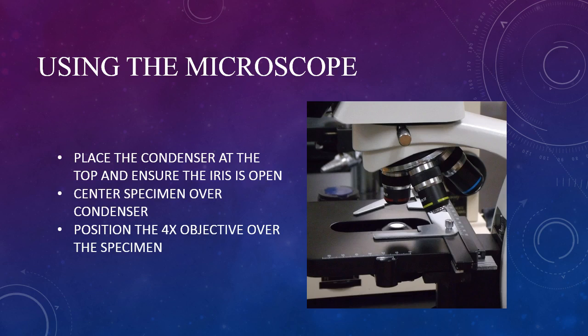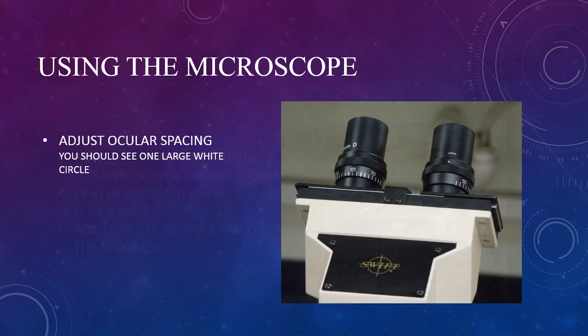You should see your specimen in the center of the small ring of light. Then be sure the 4x objective lens is in position. So far, our setup has been done without even looking through the ocular lenses. Now it's time to get the microscope adjusted to fit your own eyes.